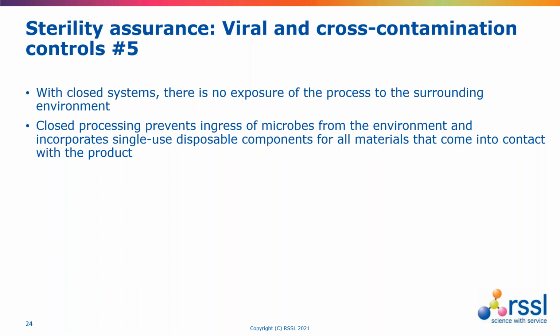But a lot needs to be placed onto the decontamination methods, and a good disinfectant is required.